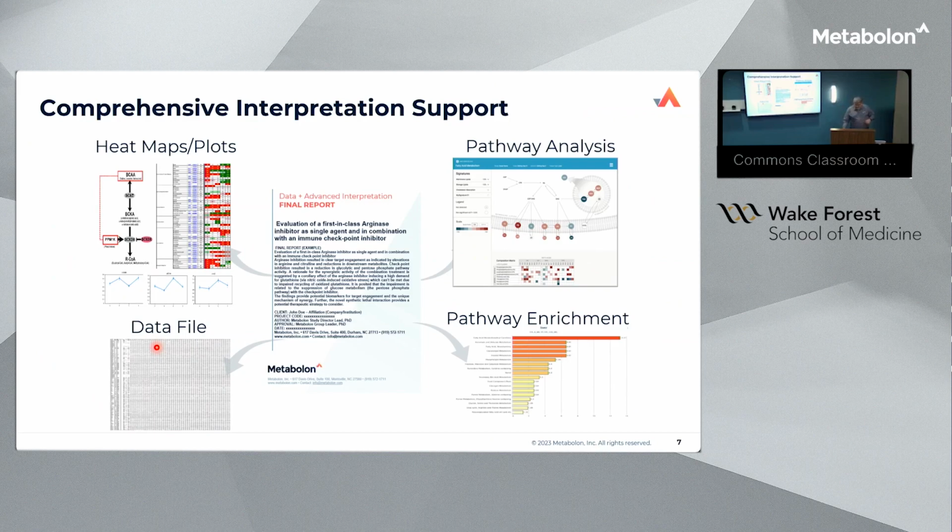And then on the right-hand side, we also have some nice pathway mapping tools available on our portal that allow you to get the pathway context of these metabolites as well.